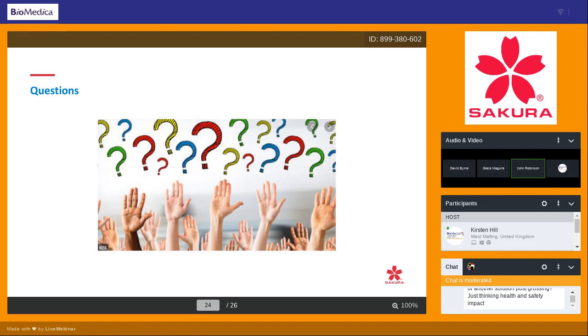Kerry, good morning. Are samples loaded into formalin or another solution post-grossing? Just thinking health and safety impact. Yes, in the video, Kerry, you've probably seen that we were loading the smart magazines, which I know you're familiar with. You've used them before, the 20 cassette magazines, directly into a formalin station on the SmartConnect. And then the lid automatically closed. So yes, that's heated formalin in there, and that sample chamber is fumigated.